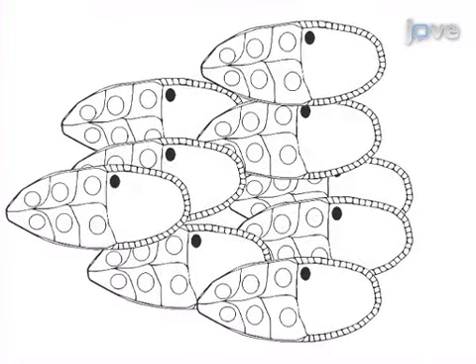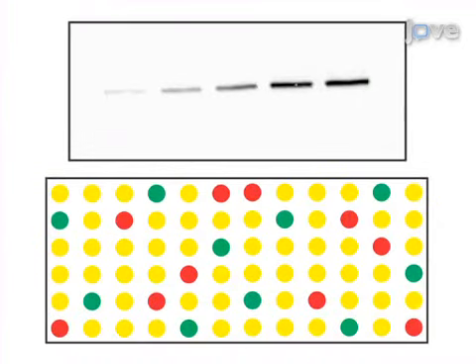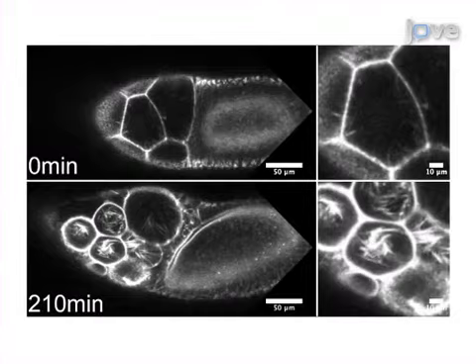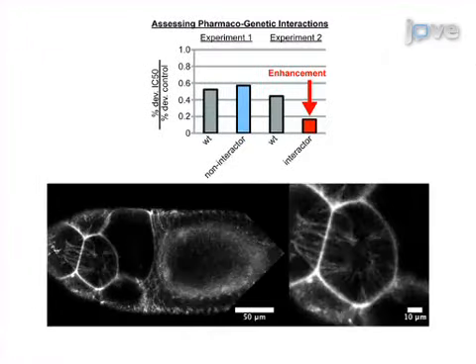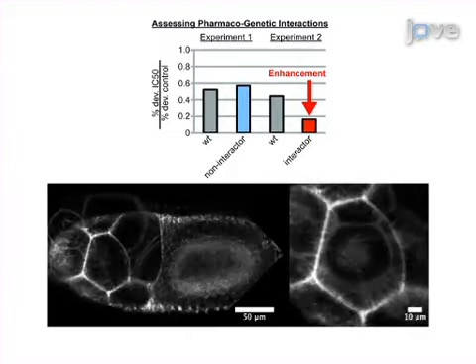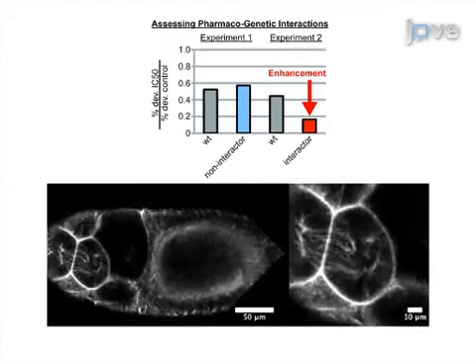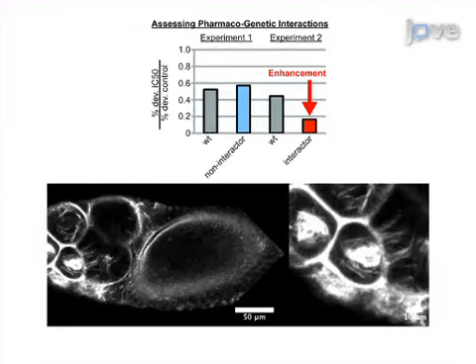Then, once specific stage follicles have been isolated, they can be utilized for molecular analyses, live imaging, or in vitro development. Ultimately, results can show what aspects of late Drosophila oogenesis are regulated by specific factors through pharmacologic and genetic manipulations in combination with these assays.